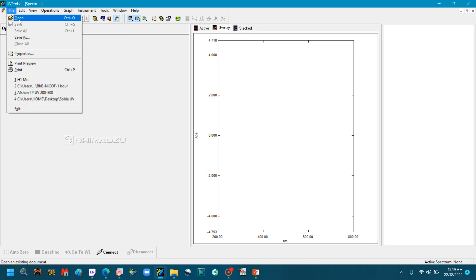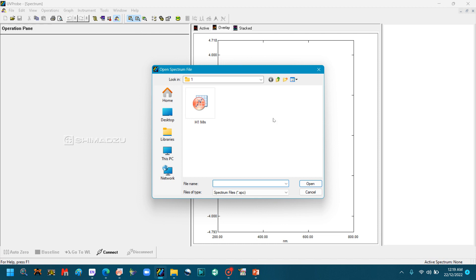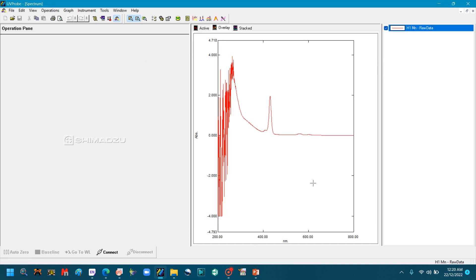First of all, we will open the UV-Vis software file. In the file, go to Open and open the file that you have taken from the UV-Vis software earlier.